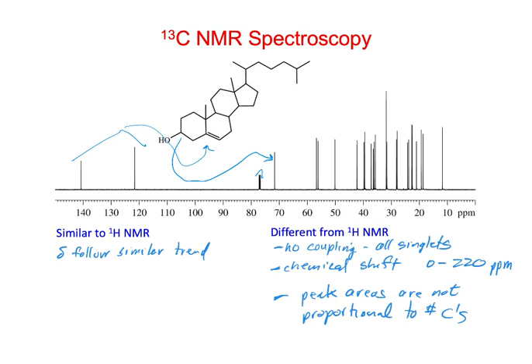All right. Oh yeah, we already talked about, here's in chloroform. This is the solvent, right? 77.0, 3 peaks like this, and we just talked about why we have 3 peaks, right? It's because it's coupling to the deuterium.